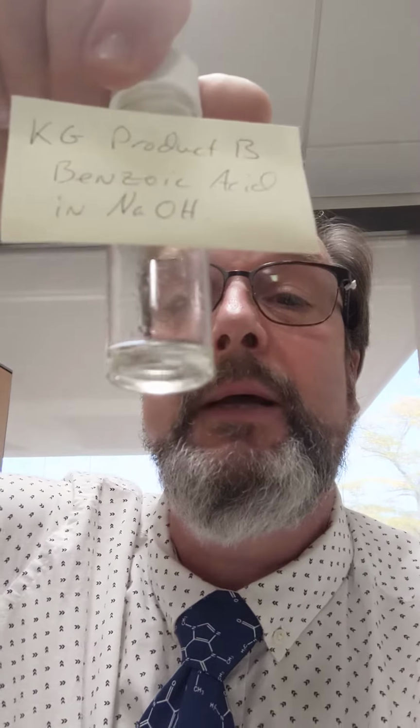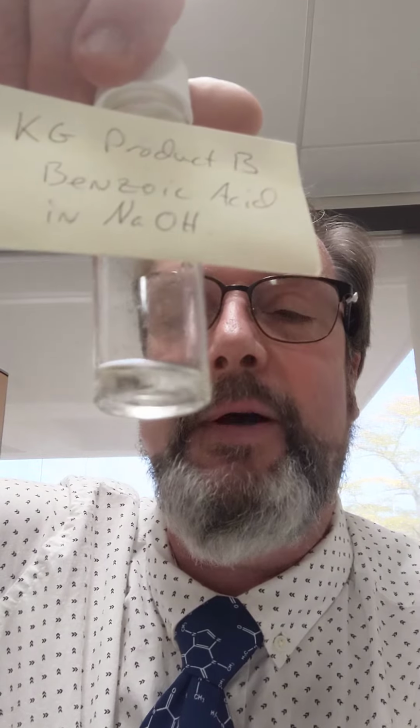The second compound was benzoic acid, and it was separated by treatment with sodium hydroxide. Now this is the sodium hydroxide solution of benzoic acid. It actually has to be acidified to convert to benzoic acid. Using TLC, you can compare the first compound with the TLC of known compounds. If the unknown and the known have the same retention factor, then they are considered to be the same compound.